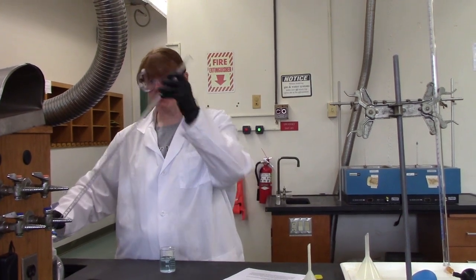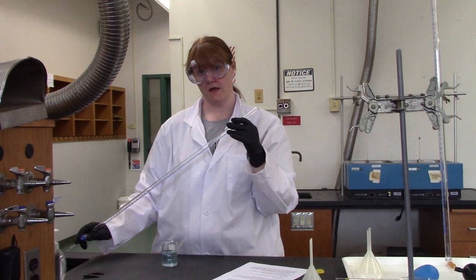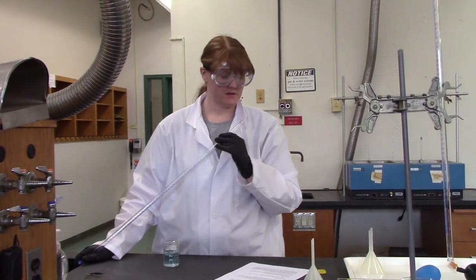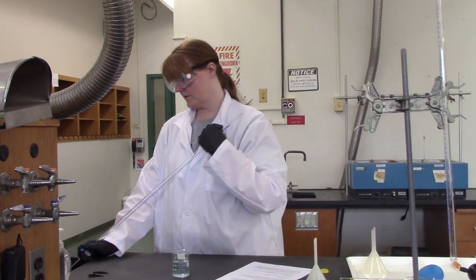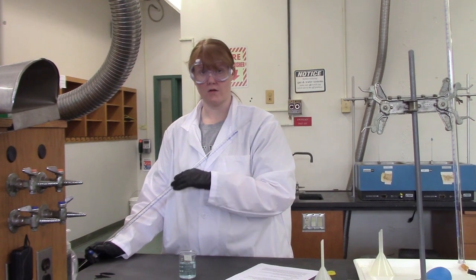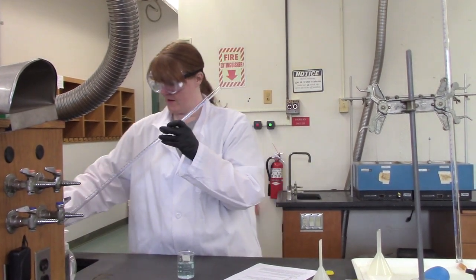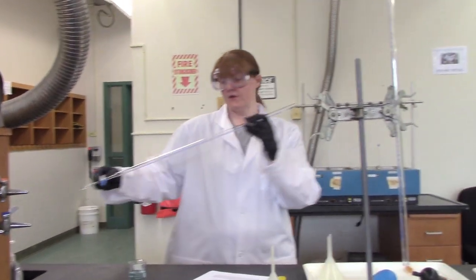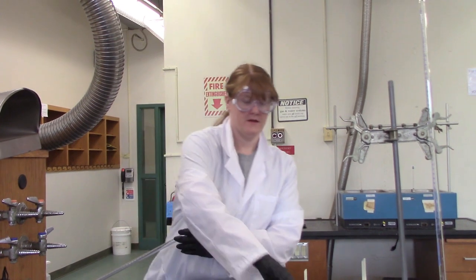Anyway, so you're gonna drain this, you're gonna rinse it with your deionized water several times. Then you're gonna do the same thing with your NaOH solution. The reason for that is just to ensure that there's no cross-contamination, there's no traces of soap or water left in your buret or whatever was used before you, all right? And so once that's done, you're gonna fill it completely, all right? So I'm gonna go ahead and do that.